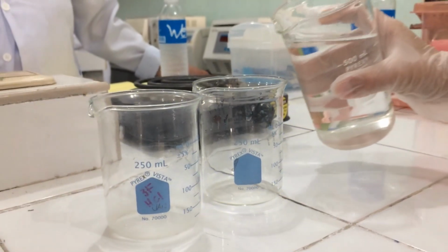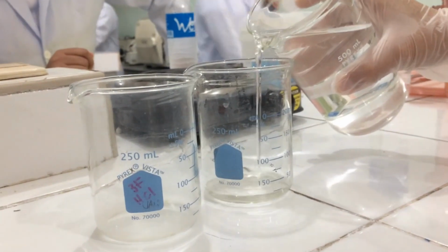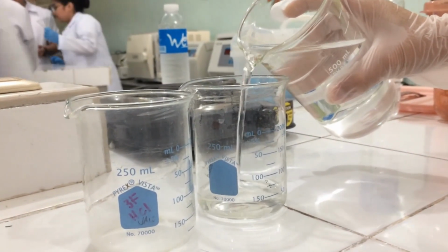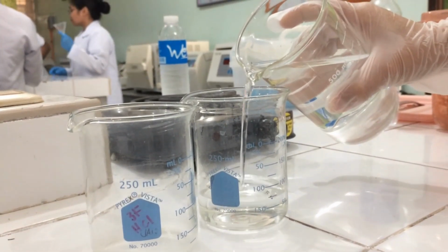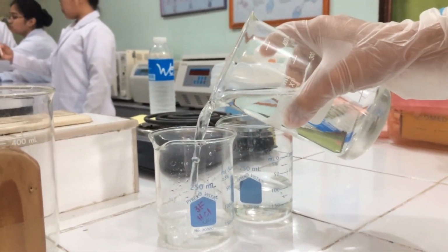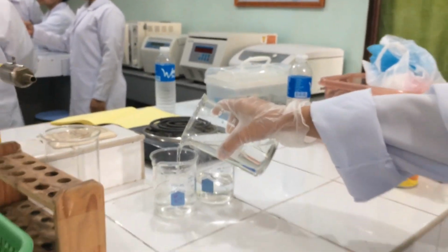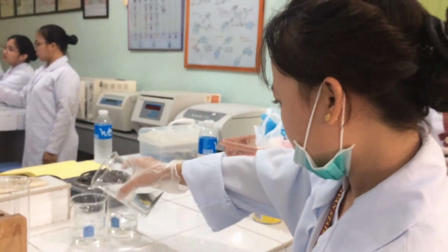Let us compare diffusion rate among two variations of temperature. First, fill two 250 ml beakers with 100 ml of water each. Next, warm the content of one beaker.